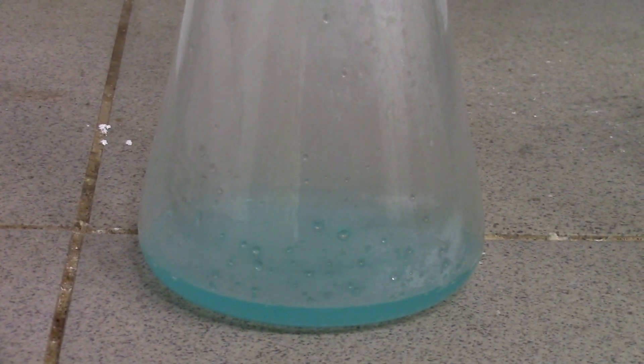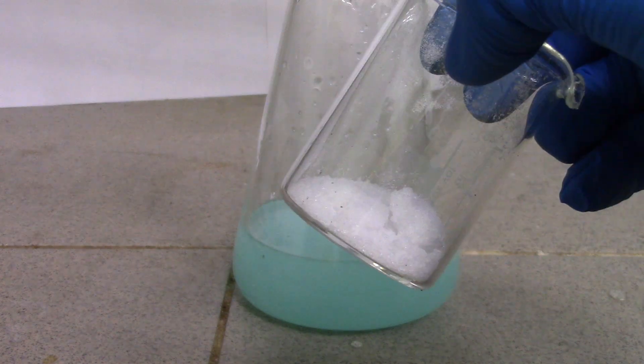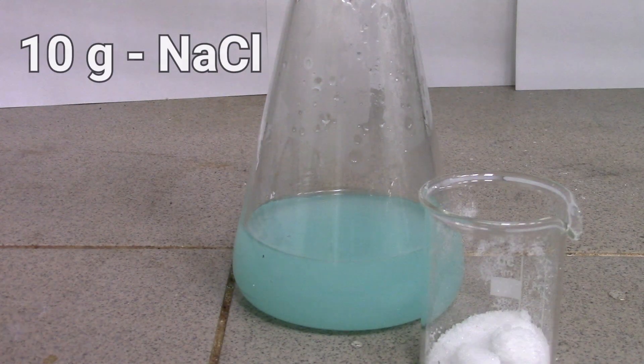My distilled water is also not 100% pure. Now we need to convert all silver ions into silver chloride. For doing it, just add a solution of 10g of sodium chloride.